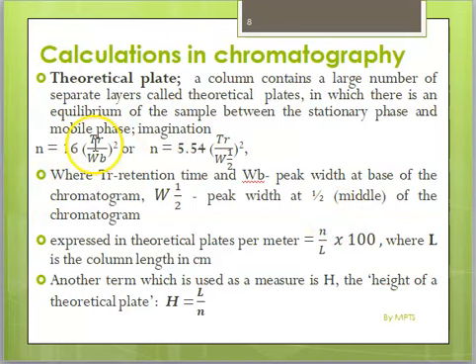N equals 16 times retention time over W base, the width at the bottom, as I said above, or you can use the W half. Retention time, peak width, and the middle can all be expressed in plates per meter. This is the equation we can use to calculate the height of the theoretical plate. I didn't go through all the equations and calculations.